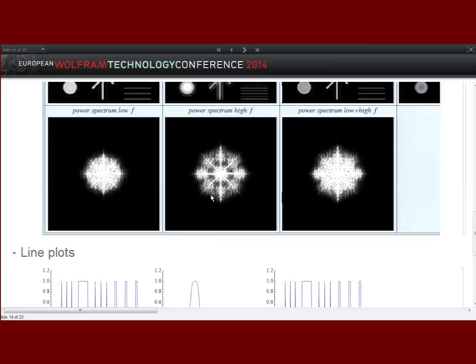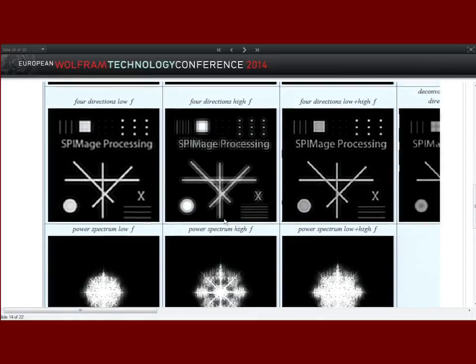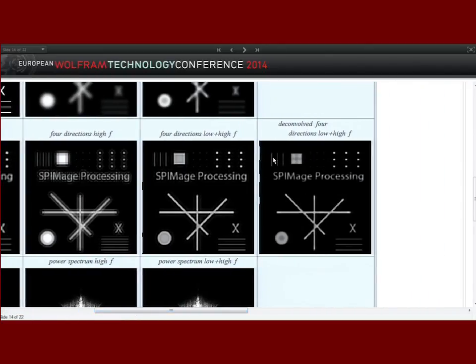And the problem when you use very high frequencies is that you generate these zeros here. And these zeros always mean that, as you can see, you get these kind of lines here on the side, so kind of double images. But if you now combine these 2 different frequencies and make sure that the space is filled in frequency space, then you truly get images such as this one. As you can see, the lines are now really well recovered. The text is perfectly readable, and you really get the perfect information. In practice, we actually go even further. We not only take 2 directions, but not only 4, but actually 6 to 8 directions.